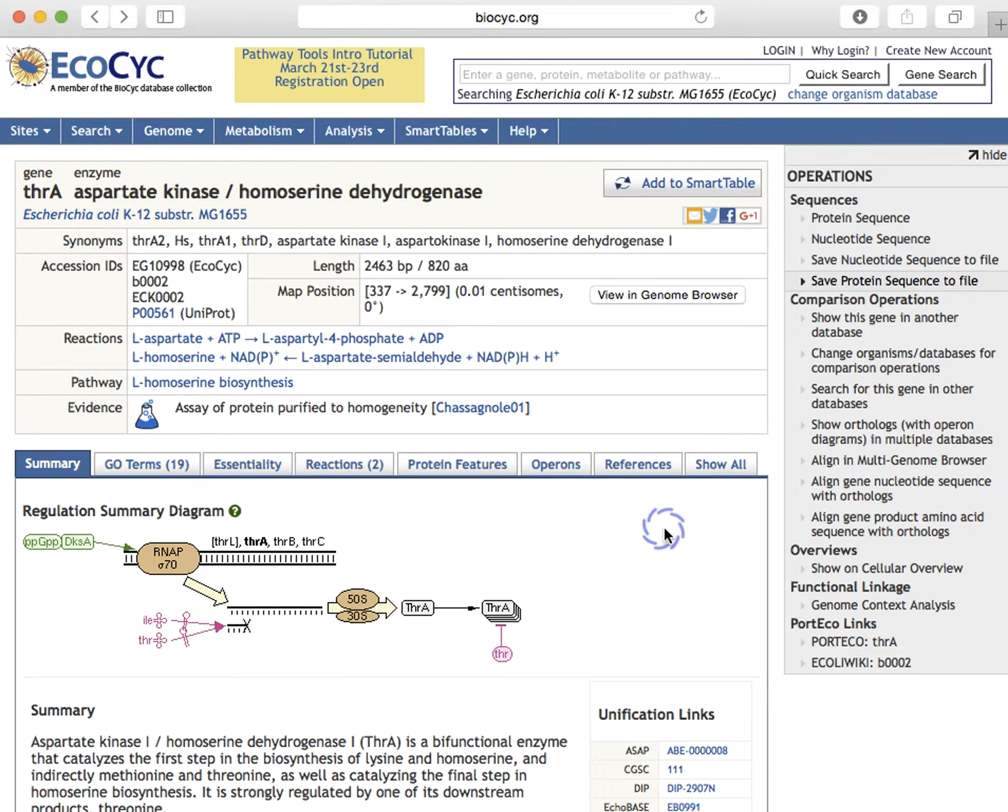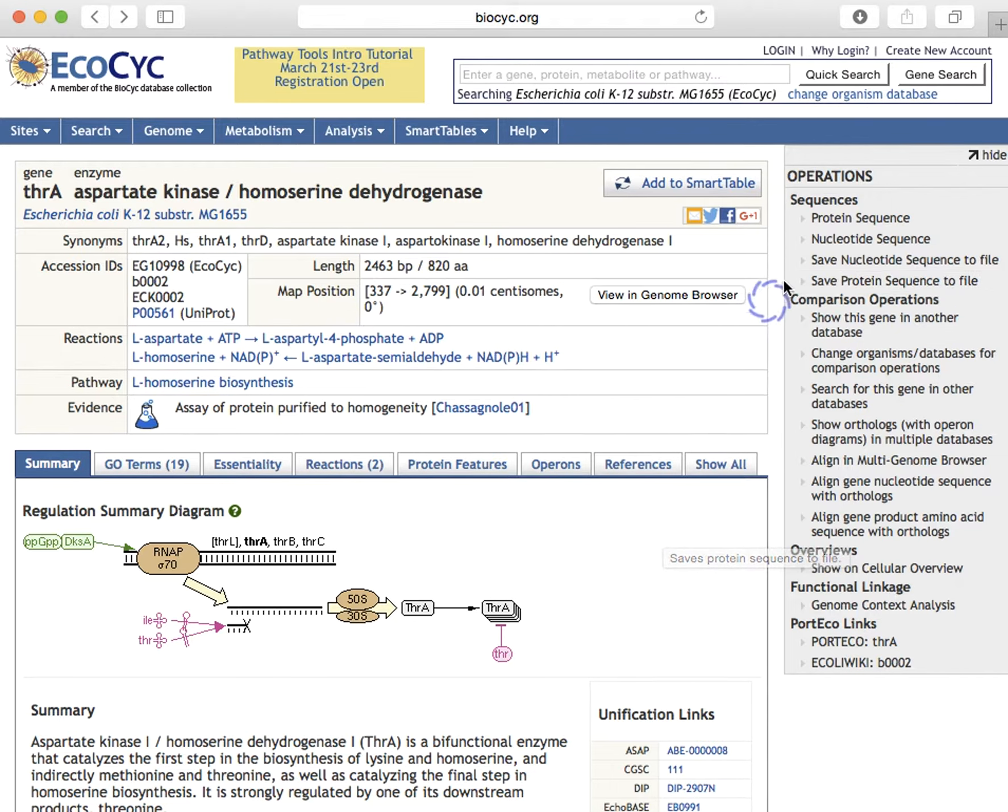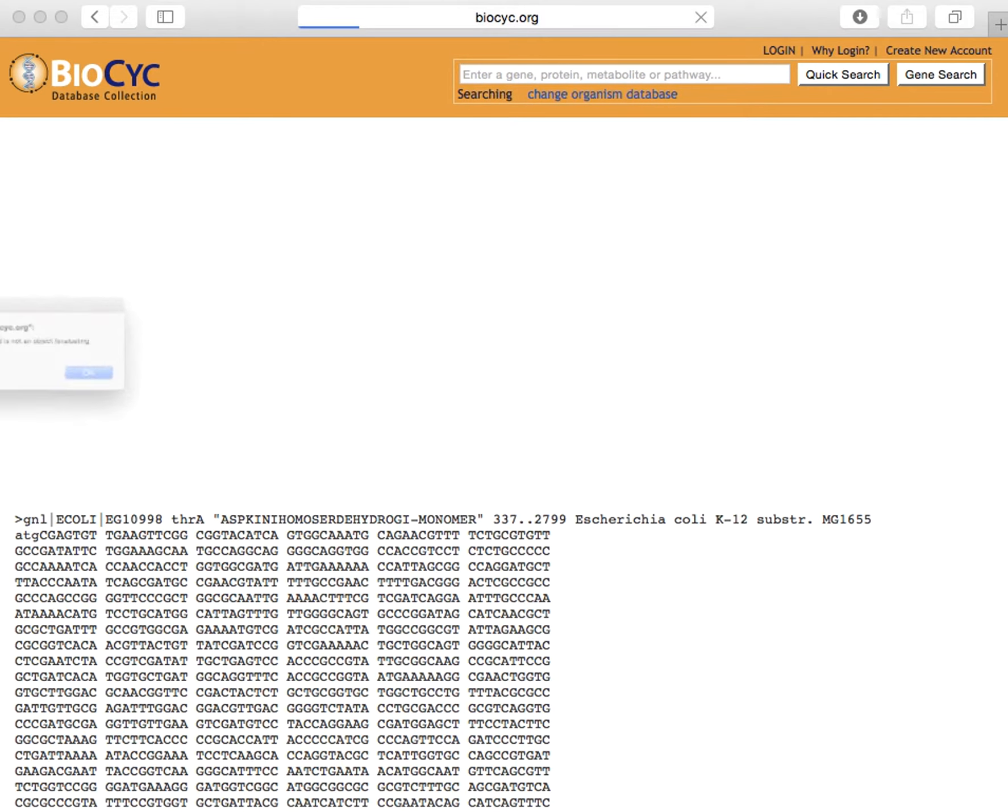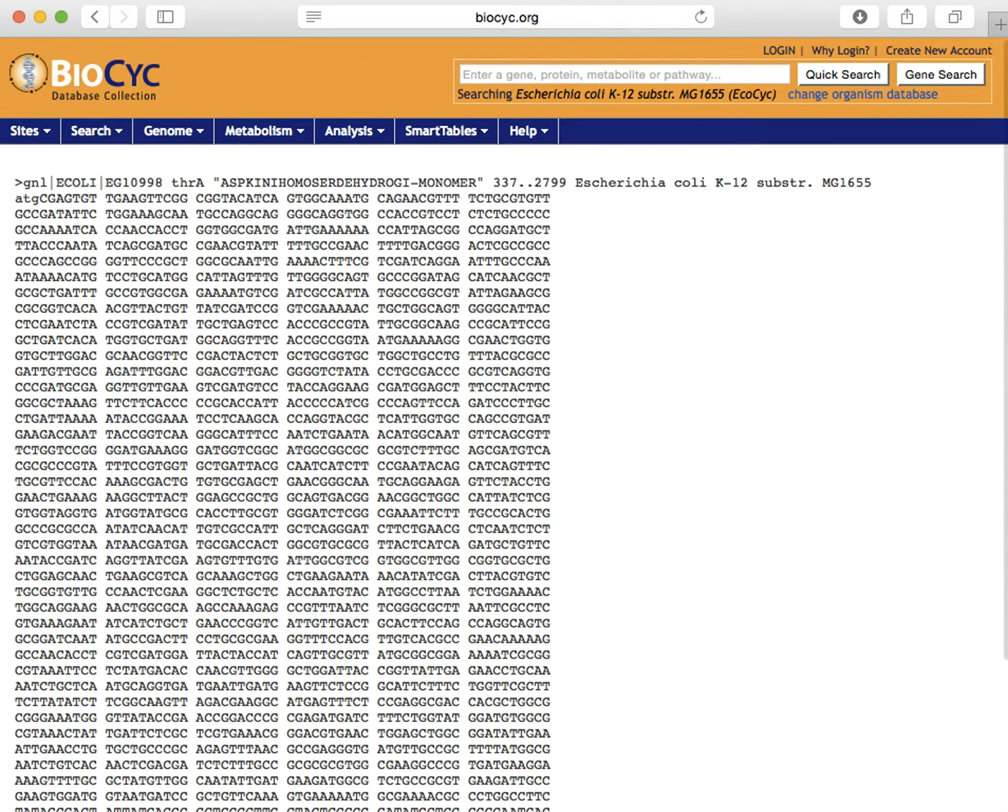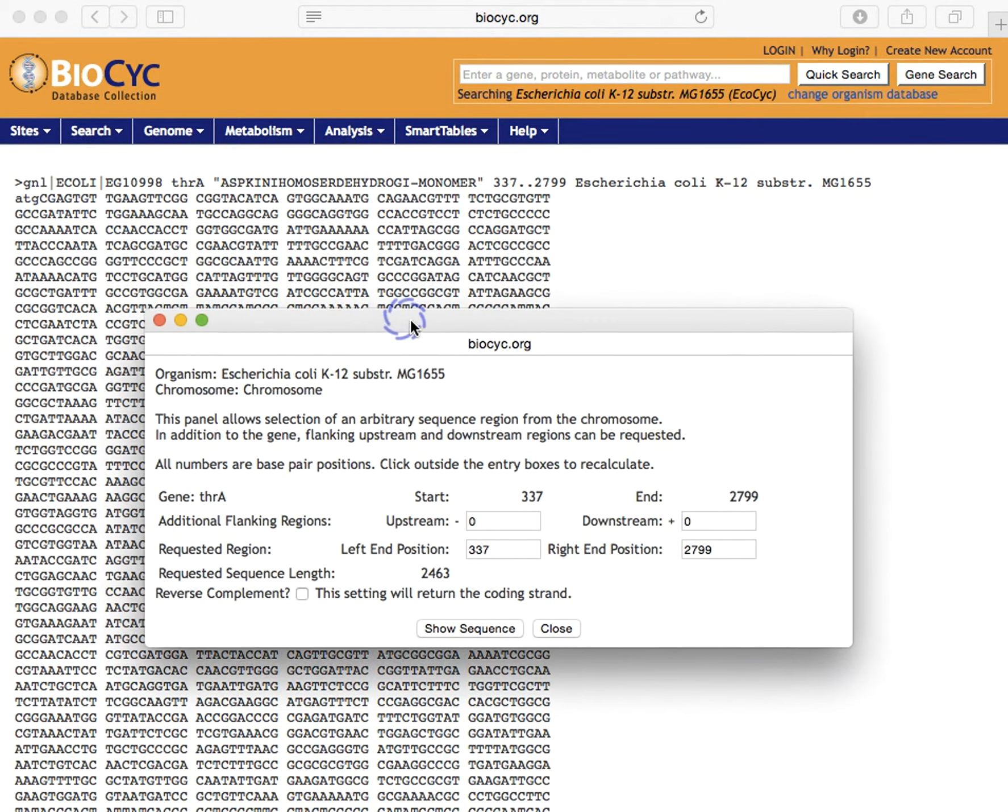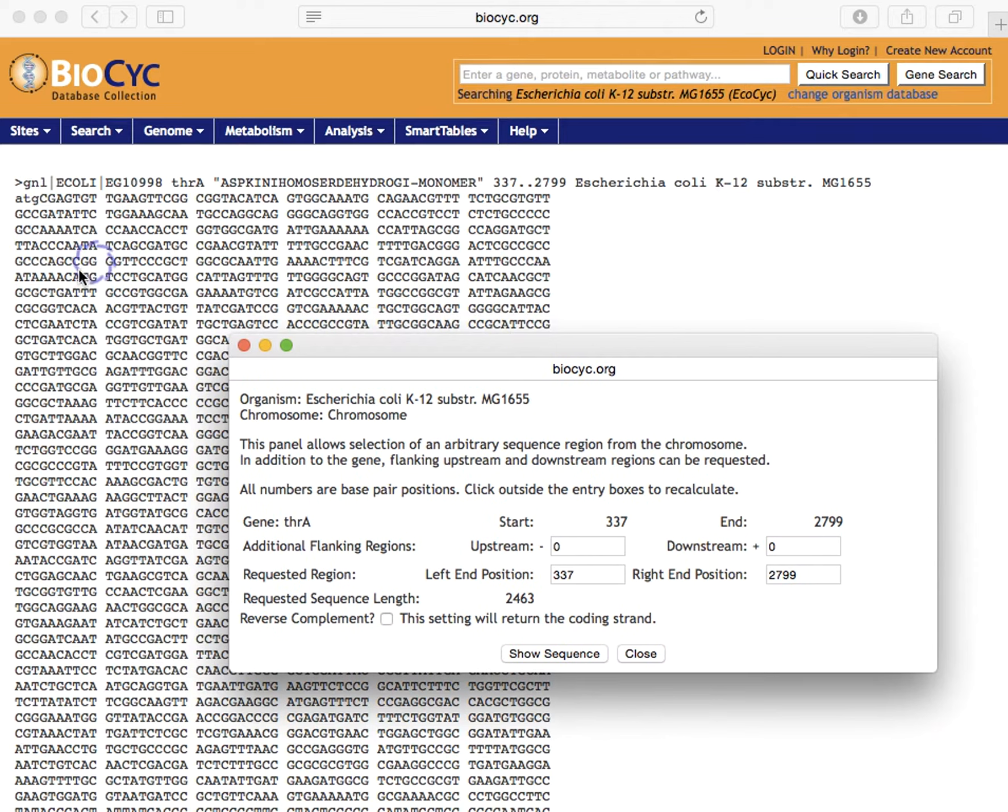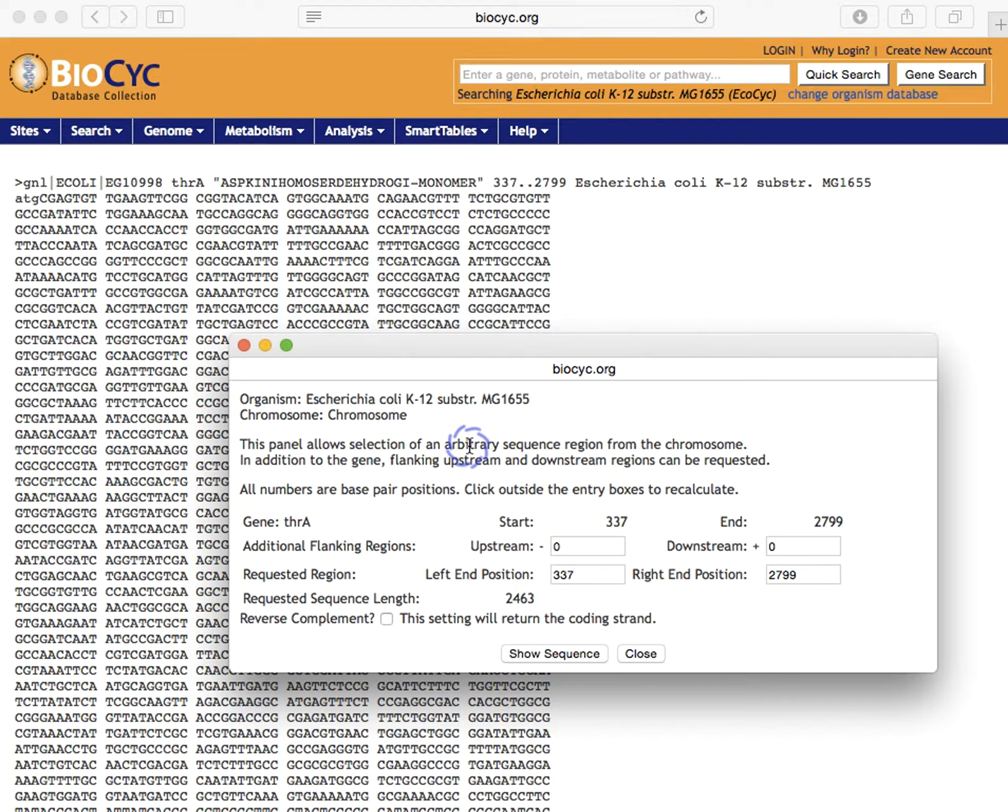To obtain the nucleotide sequence of the gene, or in fact of any genome region, we'll click nucleotide sequence, and we see the sequence of the gene in the background window, but there's another dialogue window that's popped up. This dialogue window allows us to select any sequence on this replicon.